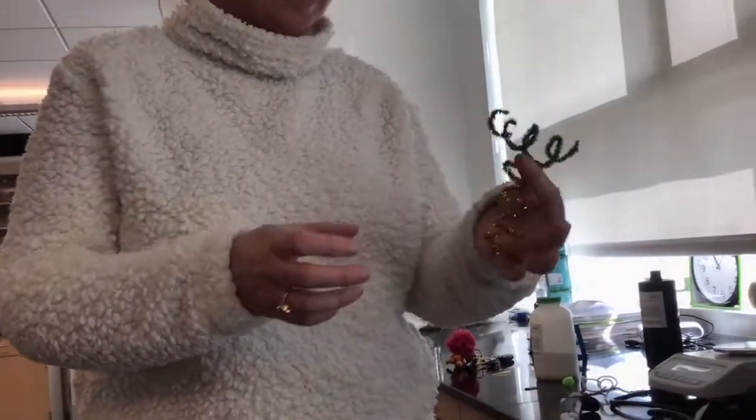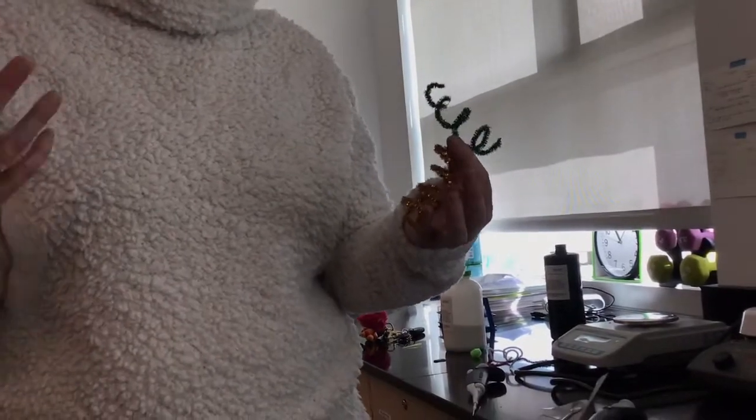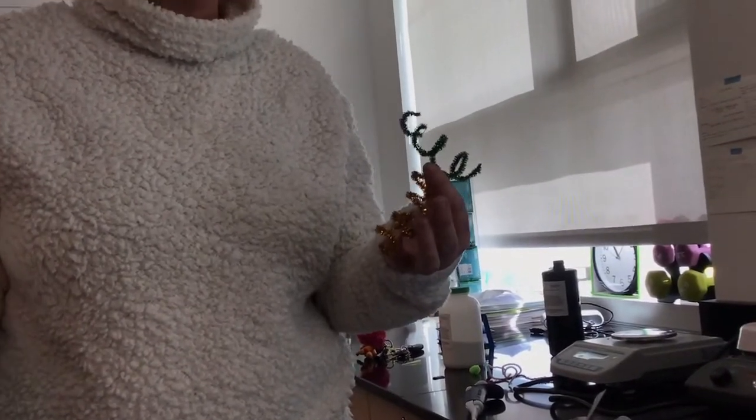It's in the saliva. And so my daughter Zosha has been nice enough to spit into a test tube multiple times. We're going to be testing her amylase, her alpha amylase activity. And so just to remind you what amylase does, and hopefully you remember this from other classes, is that amylase is going to break down amylose and amylopectin, which are the two components of starch. We're going to be looking at potato starch just because we have a lot of it sitting around.